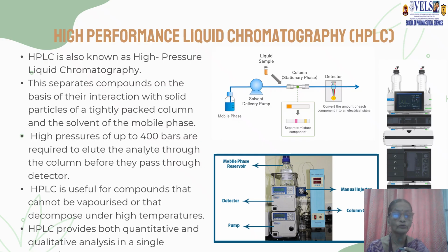Here the compounds decompose under high temperature. Those compounds are not vaporized. Those compounds are very sensitive to temperature. These compounds can be isolated by using this technology. HPLC provides both qualitative and quantitative analysis.